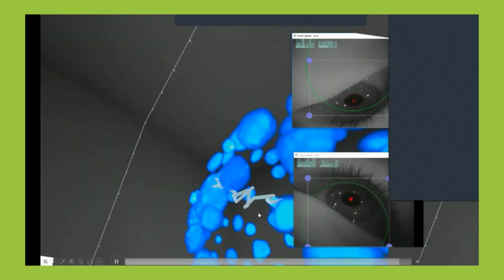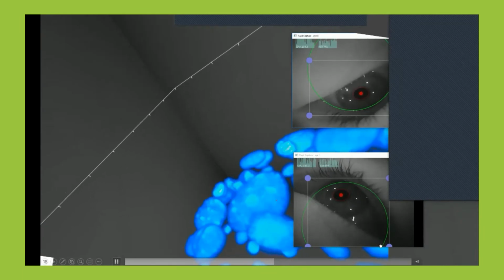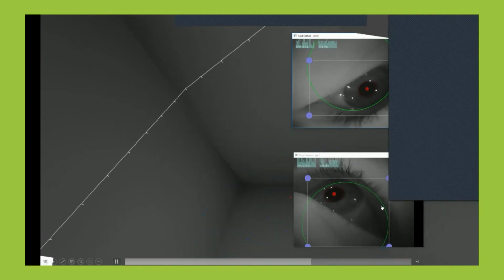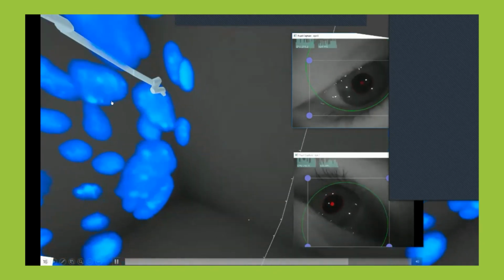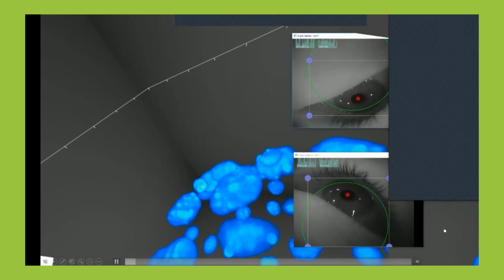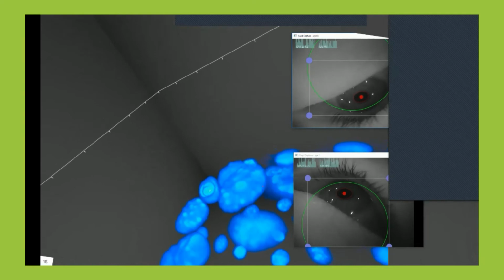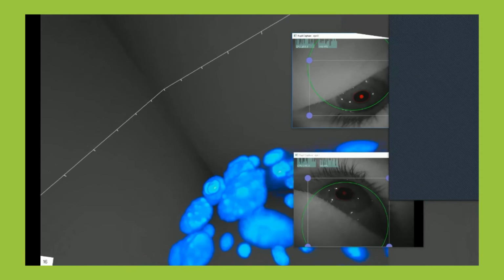But what you can see here now is that the cell that we've actually been tracking, we could create quite a good-looking cell track from it. So now it's calculating, and you can see the cell is nicely moving along the track that I've just been creating by looking at it. The data set that we've been using in this trial was 101 time points. And the entire time it took me to create this track was about 30 seconds. So this also works pretty quickly.